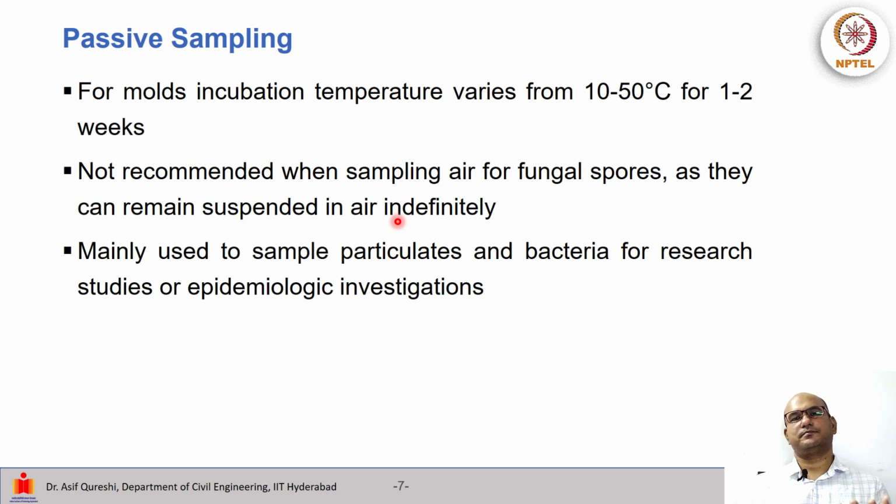The whole method of passive sampling relies on the microbial matter coming and depositing on the surface, but fungal spores actually remain suspended for a long time. So the method of deposition does not work very well when fungal spores are of interest, and therefore this method is not recommended.